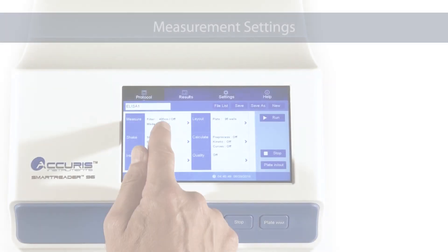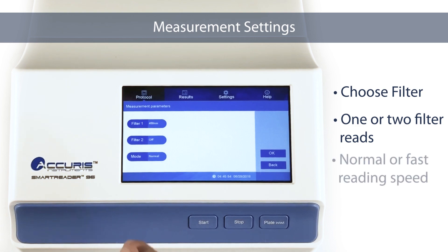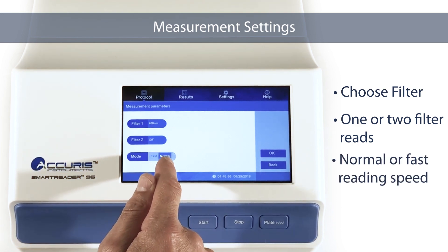Measurement Settings. Press the Measurement Settings section to choose one or two filters for the plate reading. Reading speed can be adjusted to normal or fast.